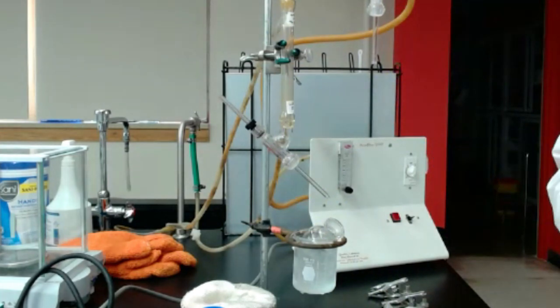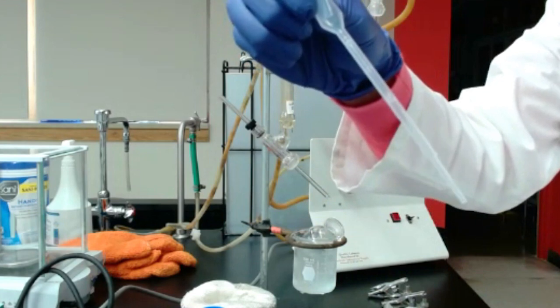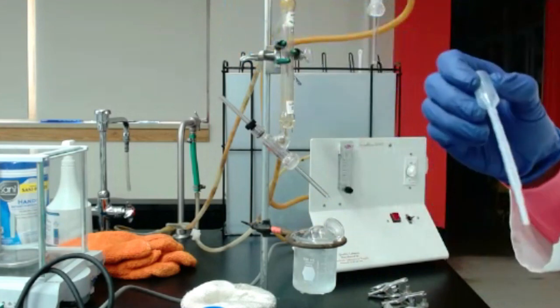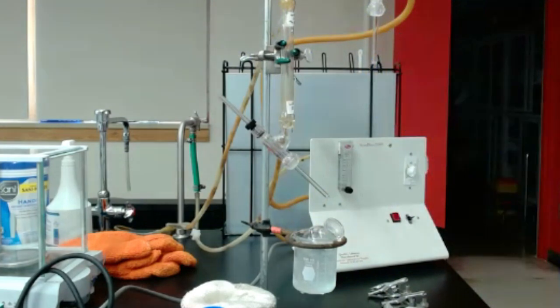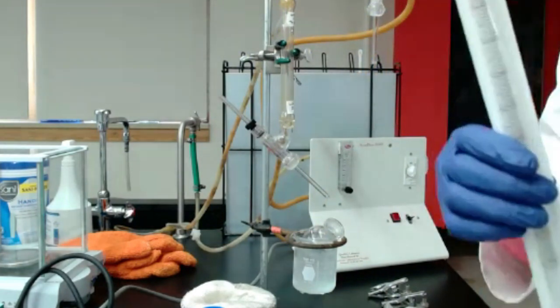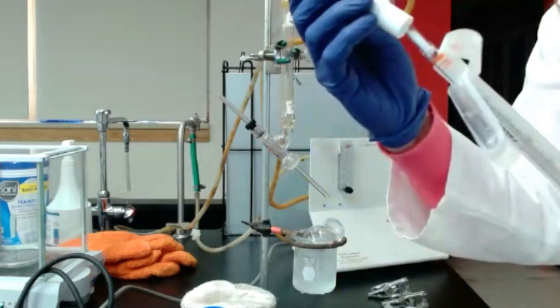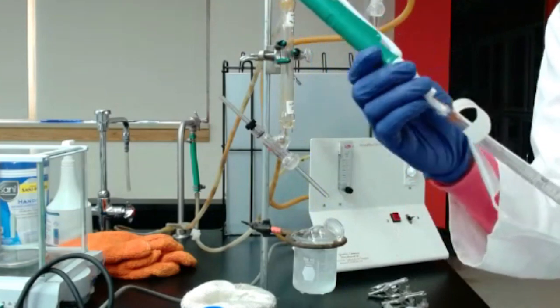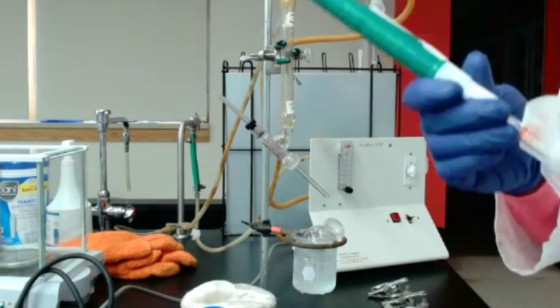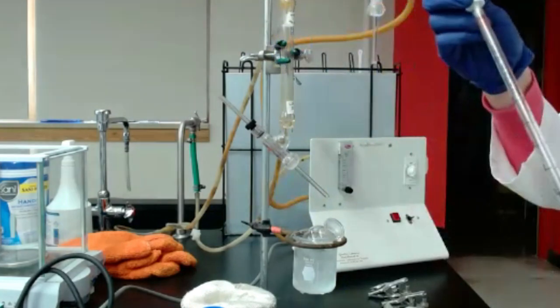All right. So to start, you will need a few different things. First, you will need some transfer pipette to transfer some phosphoric acid, but also the color indicator. You will need also some pipette and the pipette pump that you should have now. That's just to be specific and precise in the volume of wine and volume of hydrogen peroxide we're going to use. So you will just plug those two, and that's what you would use.